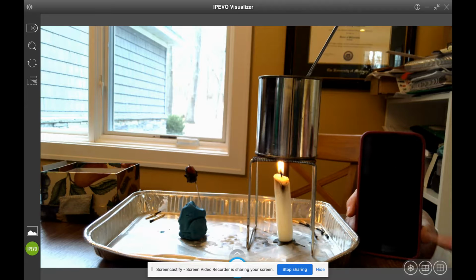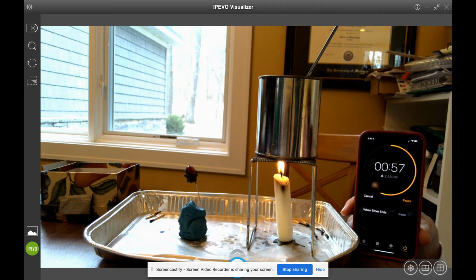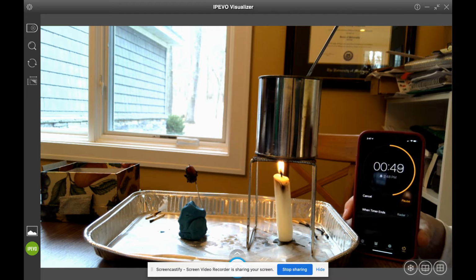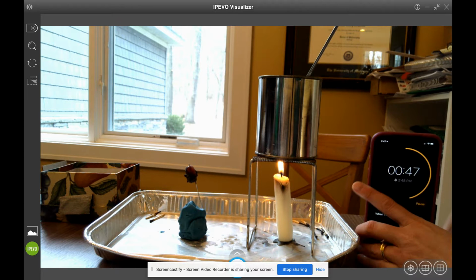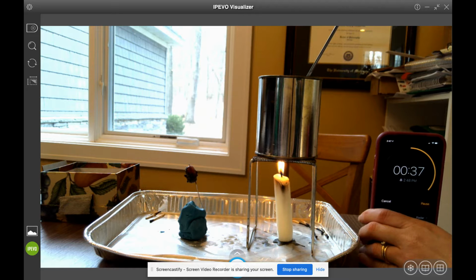We've got 1 more minute to go. 22. 22.4, I think. 24 is my prediction. 22.8. Yeah, it's going to get higher than my prediction.